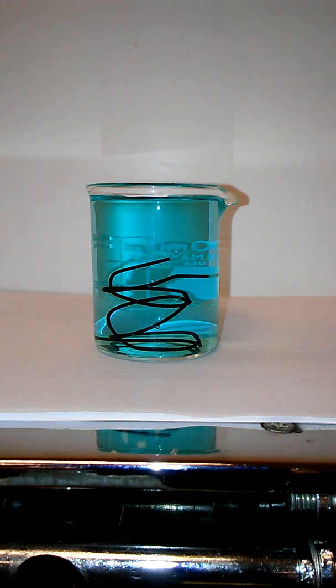Anyway, what that means over here in solution is that we should begin to see copper metal on the paper clips. And if you look at the paper clips, and they're not necessarily the easiest to see from where you are, they are no longer a shiny silvery metal. They look very dark or black, and if we were to pull that out, you would be able to see the reddish coating of copper metal on it. As we let it continue to go, the coating of copper will get bigger and bigger and bigger.